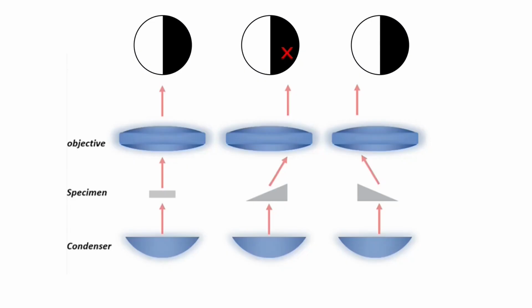This is the basis of all asymmetric methods, including oblique microscopy and Schlieren methods such as SSEE. It causes a type of shadowed relief contrast that cannot be seen in ordinary bright field.